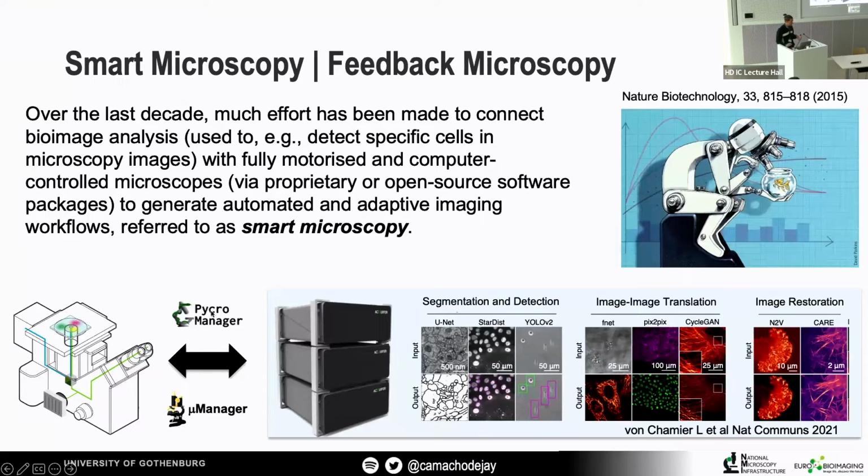And that, of course, can be the nice software that the company provides, but also perhaps if we need something slightly different, we might want to go to some open access software. I was in the field where we were building our own microscopes. So maybe you take a body from a company, a camera from another company, and now you need some extra, third-party software to be able to connect them all together, right? Such as Micro-Manager. Now, this part would be, again, the strategy of the classical high content screening, right? So I can control it, I use it.